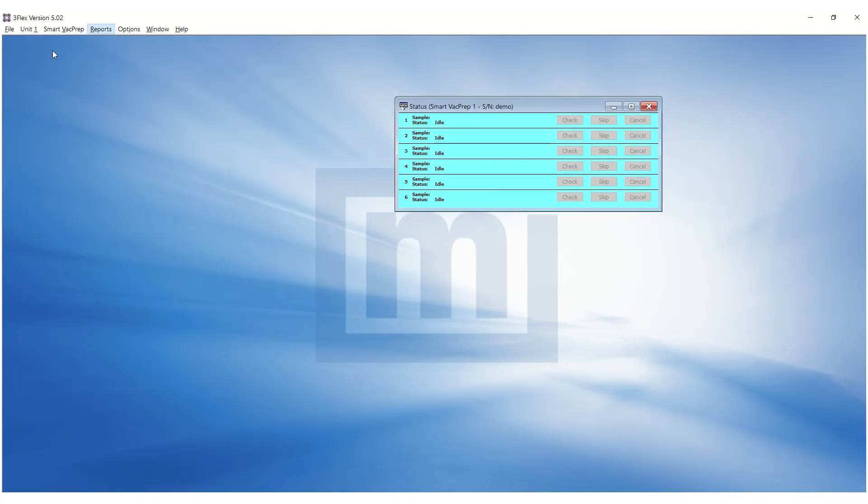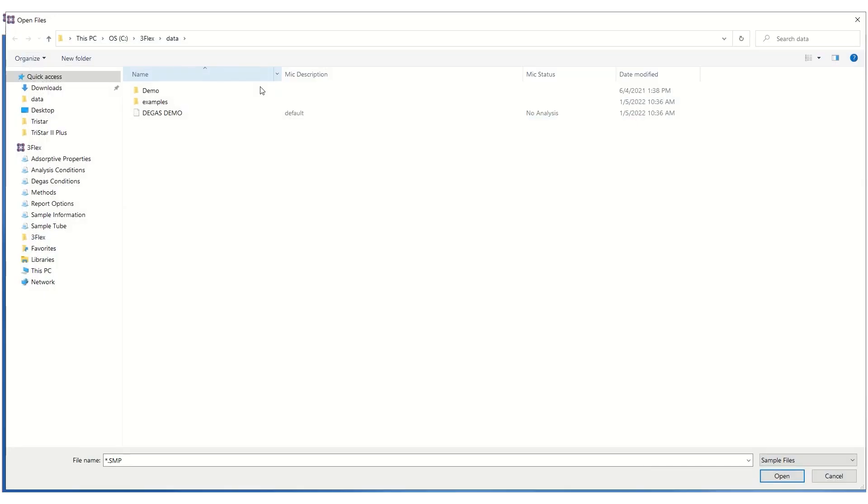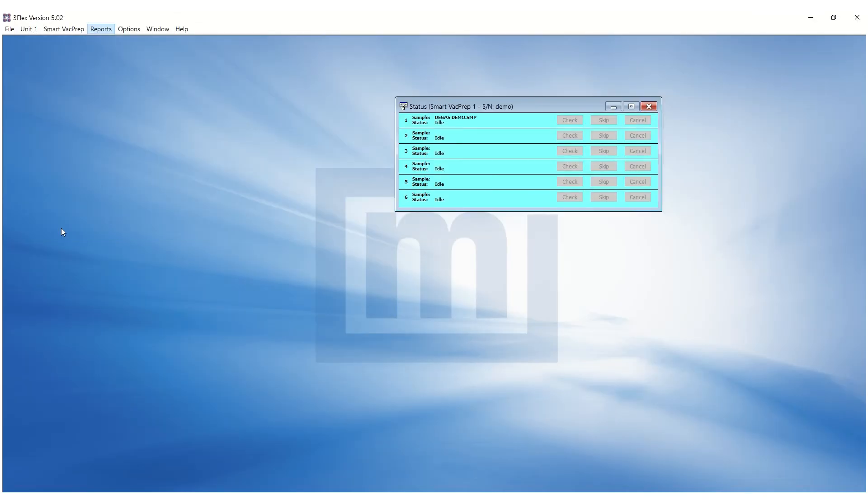To start degas, go to the SmartVacPrep menu, prep, and click on start degas. Click browse to select the SMP file for the appropriate degas port and click start.